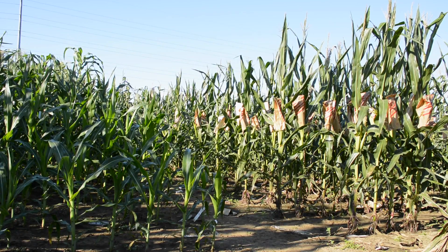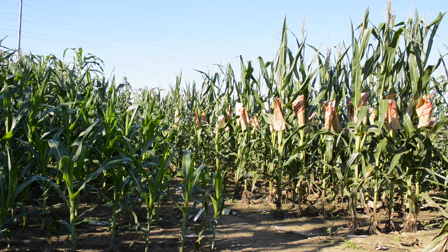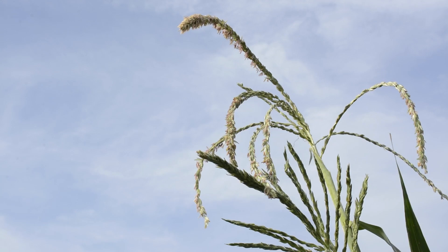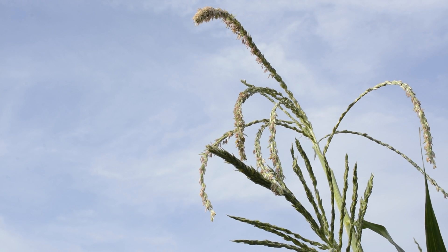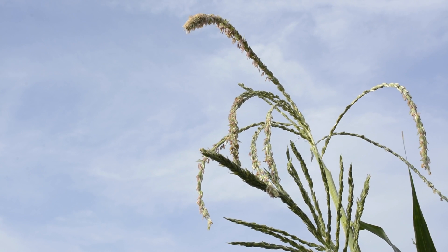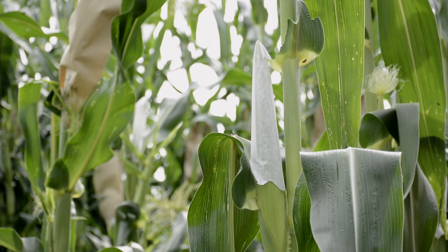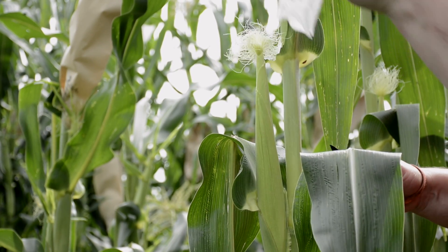As the plant develops over time, we can determine whether we're ready to make a pollination. On the first day of making an actual pollination, you need to look at the tassel to see whether there is pollen available. When there's pollen, you know you can make pollinations. You also have to look at the recipient female to see if the silks are available. When you know that you have tassel and silk ready, you can set up a pollination.